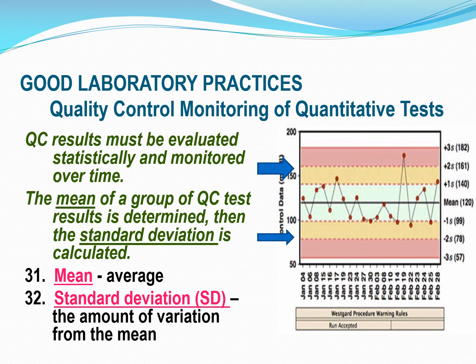And you want to graph this so you can start seeing if a problem is starting to develop before it becomes a problem. That's what we want to do. We can also pinpoint if we have a person working in the lab that maybe is always the one that seems to get the really high or really low results. These can be very valuable in spotting issues that are going on in your lab and getting a hold of them early, because we always want to give out the most accurate and reliable result as possible.